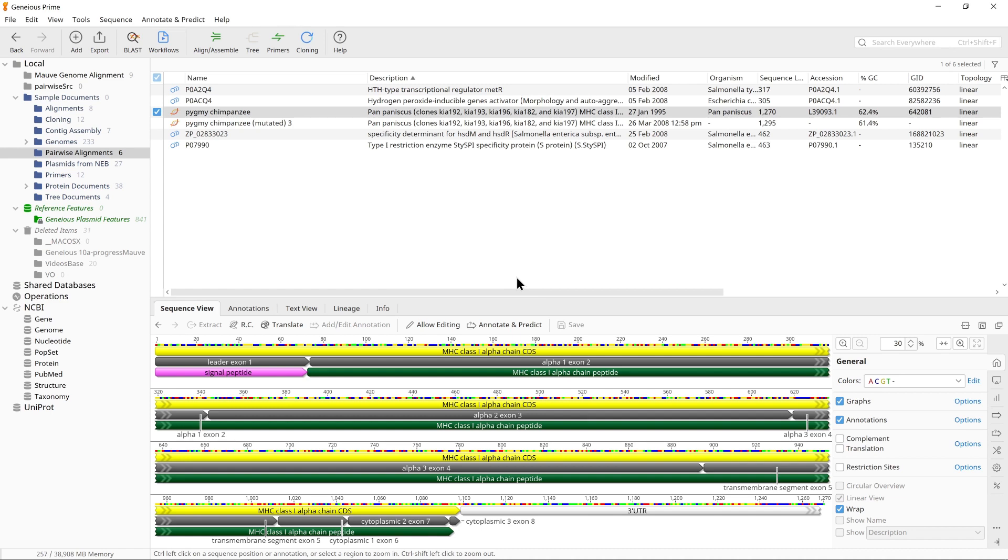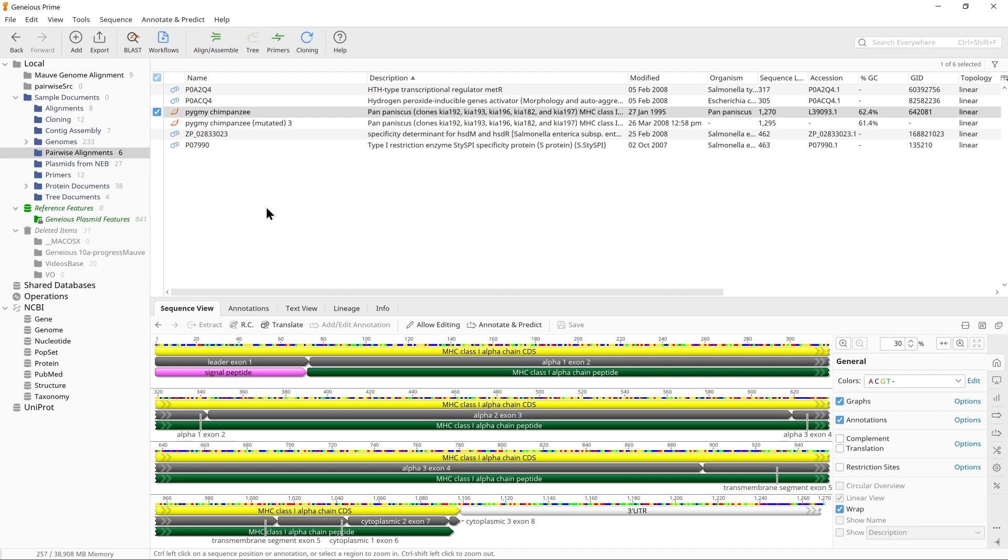Pairwise alignments and dot plots are methods to determine the homology between a set of sequences that span the same gene or genomic region. Dot plots are an excellent visual way to view the regions of similarity between pairs of sequences, which cannot be reproduced just by sequence alignment.